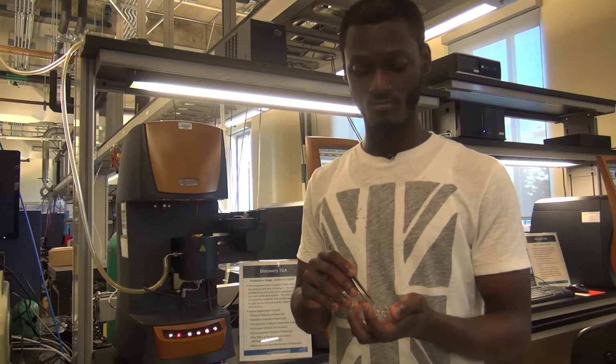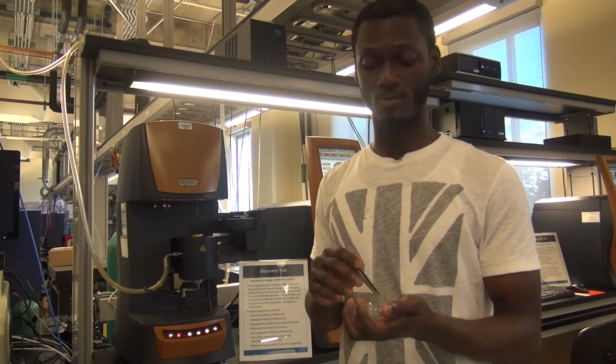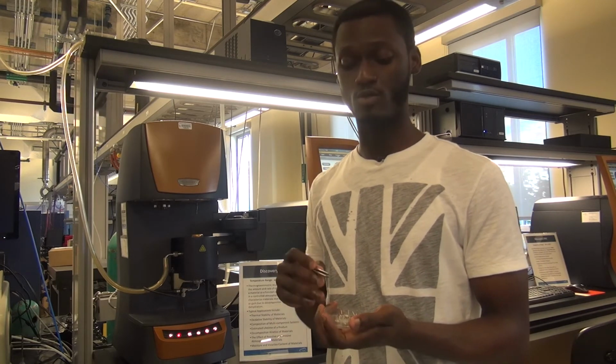Okay? Do we need to buy this or? No, we generally replace these every once in a while. These are reusable, so I'll show you how to clean them. But we generally replace these once we realize they're getting a bit old, like some of these are right now. We probably throw these away and purchase some new ones. Okay? So generally, you don't have to buy these that are in here.